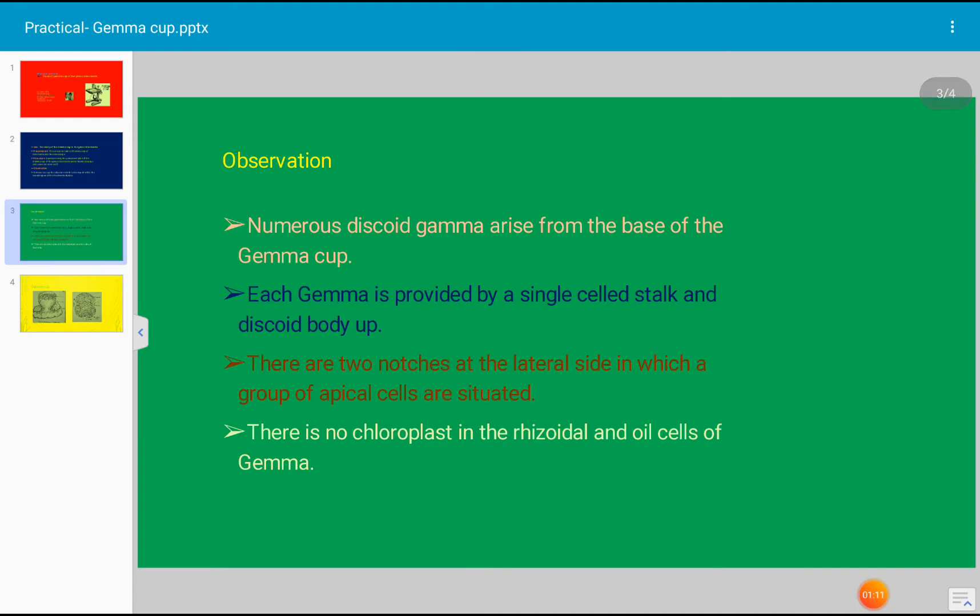Another point: numerous discoid gemma arise from the base of the gemma cup. It is a cup-like structure, and inside the cup there are many discoid gemma present.